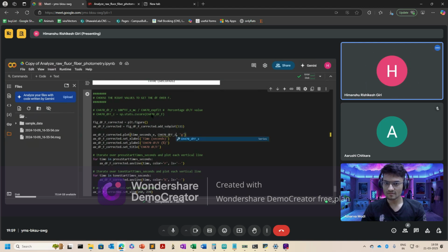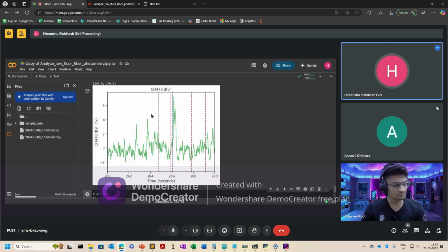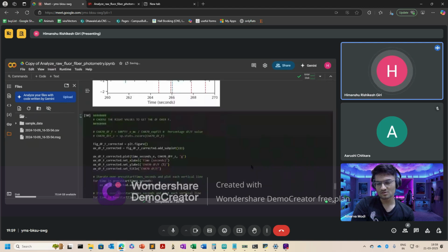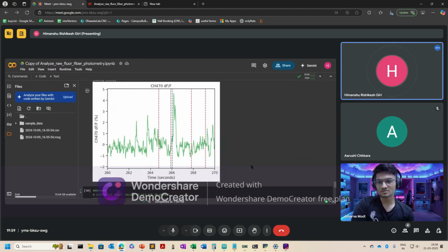Yeah, a very similar looking profile. Of course, it will be, but the values are also a little different. Z-scoring has another way to do it.